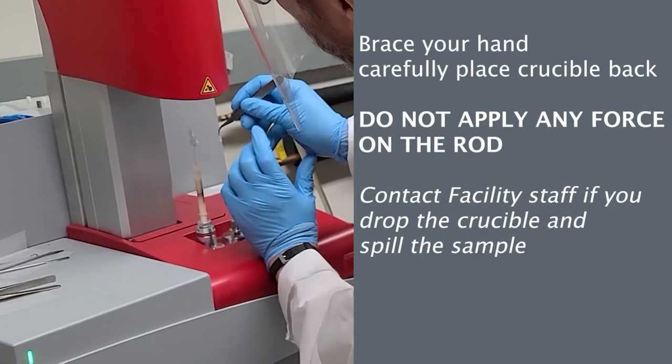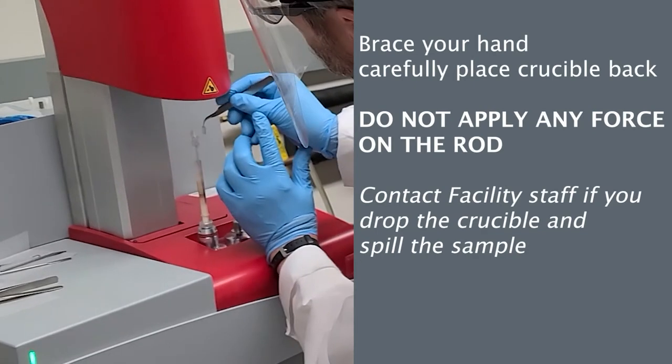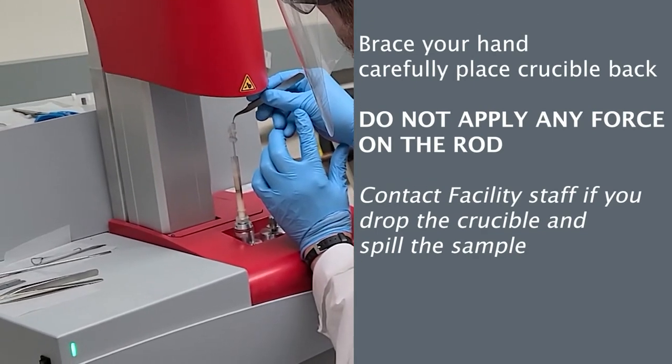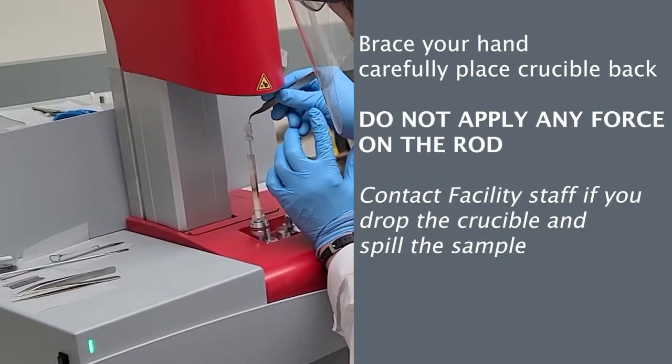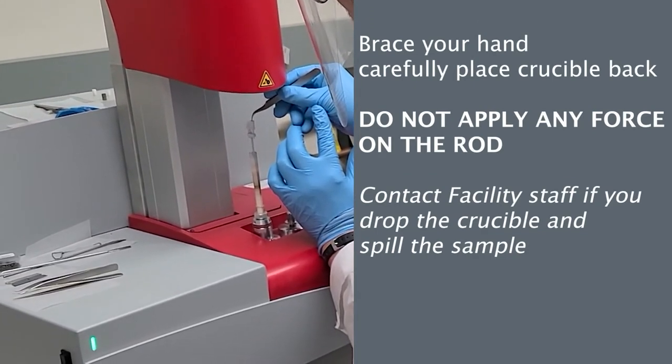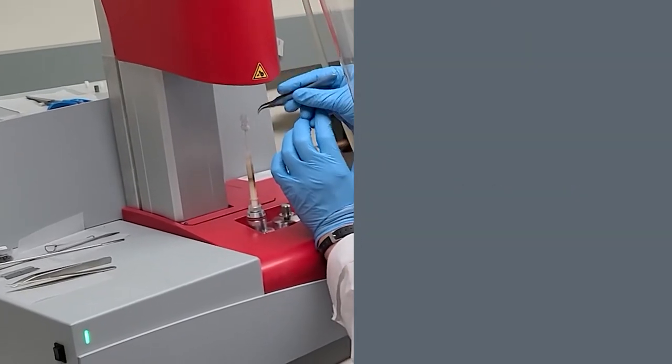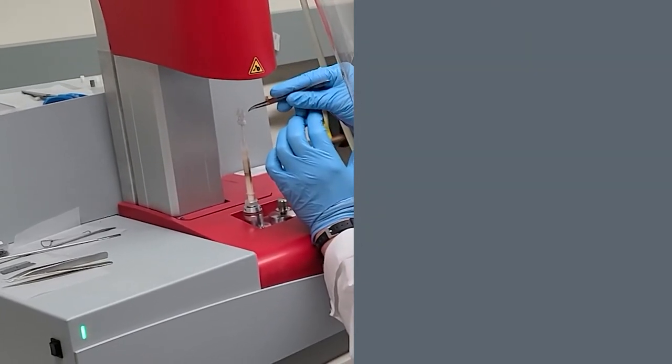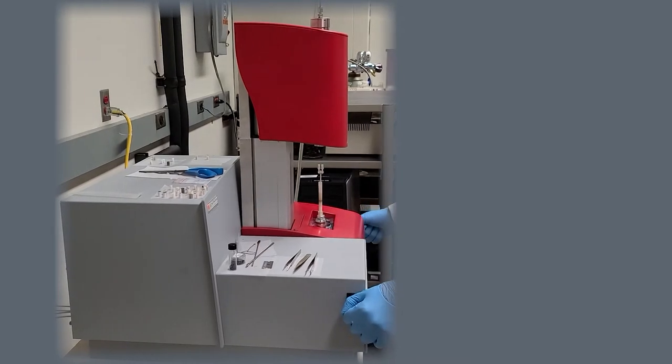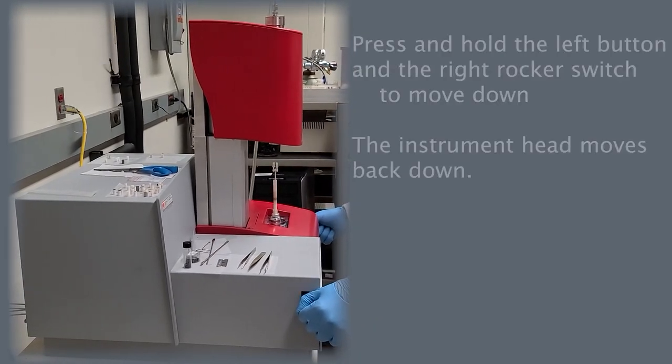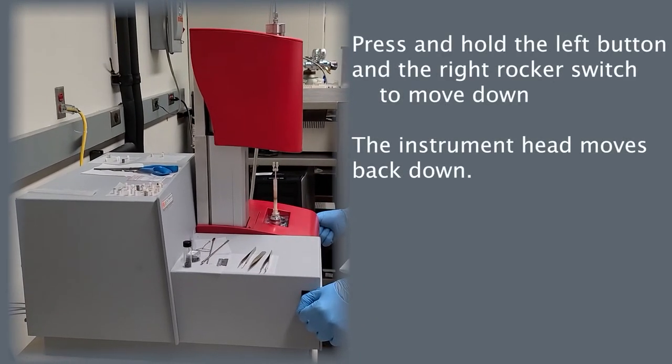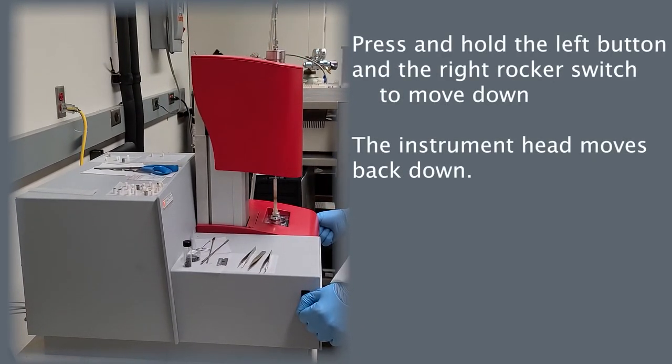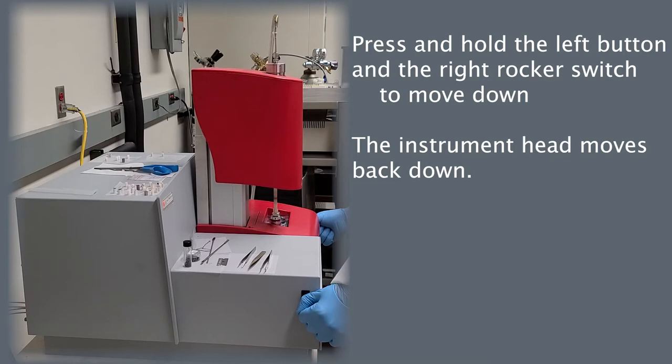Very carefully and gently, place the crucible back in place on the measuring rod. Press the buttons on either side of the instrument to lower the instrument head back down.